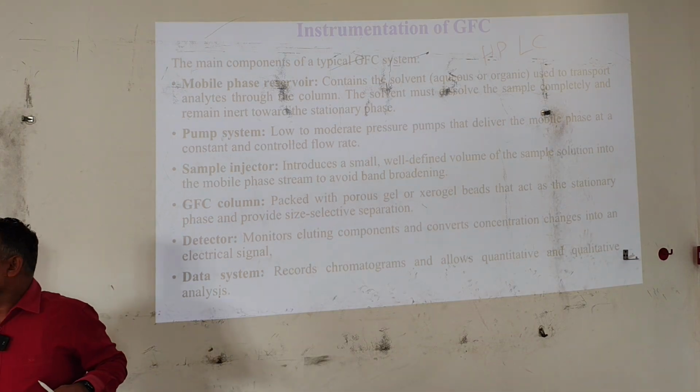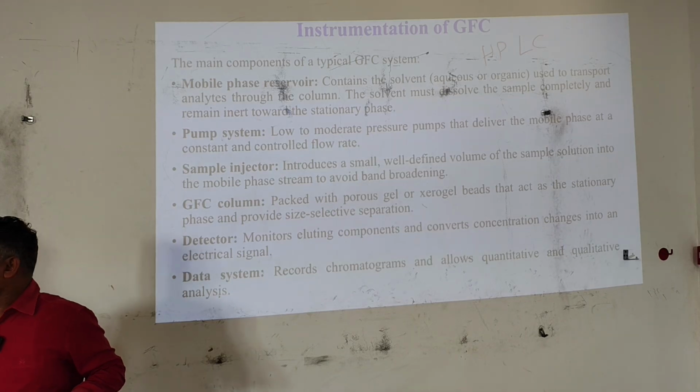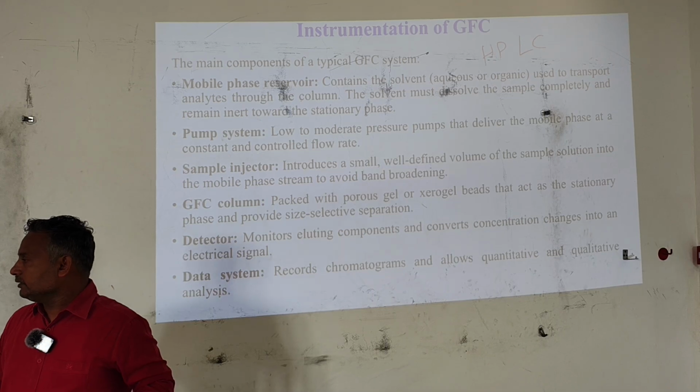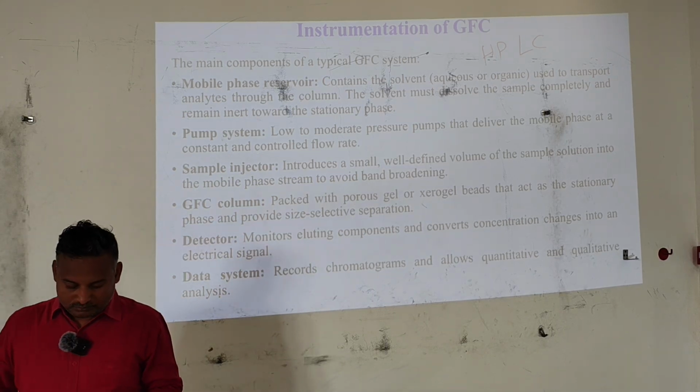Take it. Check. You need to increase the angle of inflation. Yes, right. Angle. Fine. That is okay.